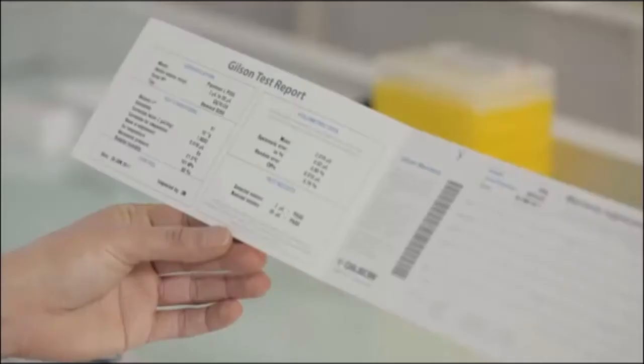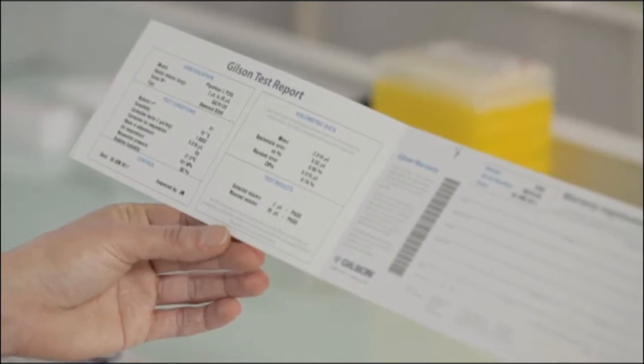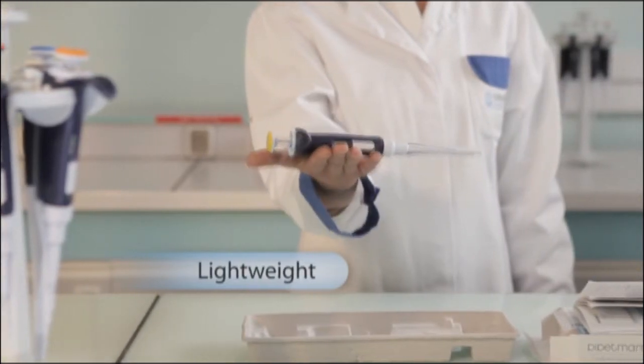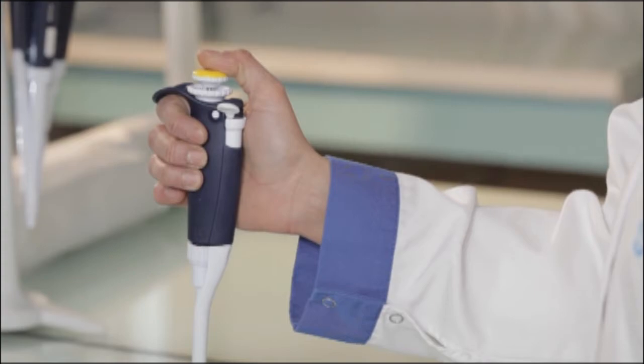The Pipet-Man L is delivered with its original Certificate of Conformity to ensure the highest precision and accuracy. According to ergonomics experts, Pipet-Man L weight is ideal to achieve the right balance between comfort and lightness.